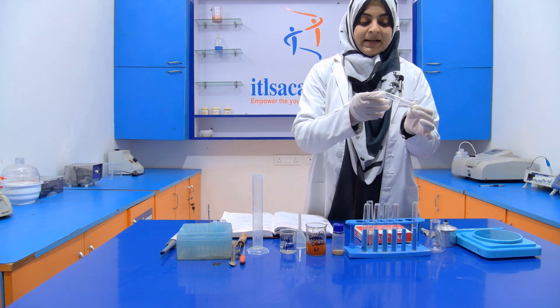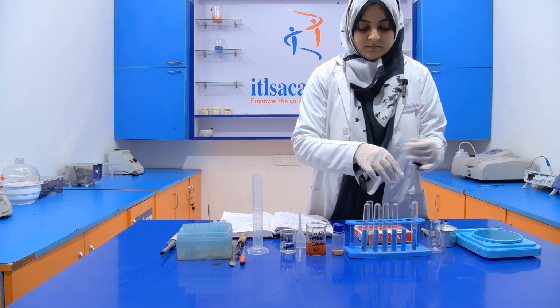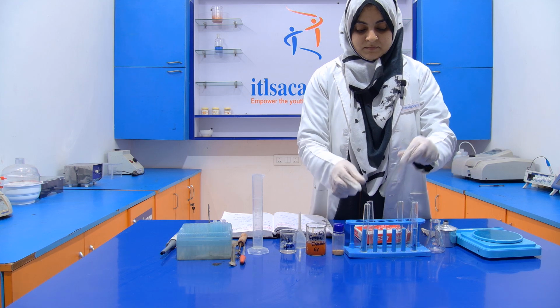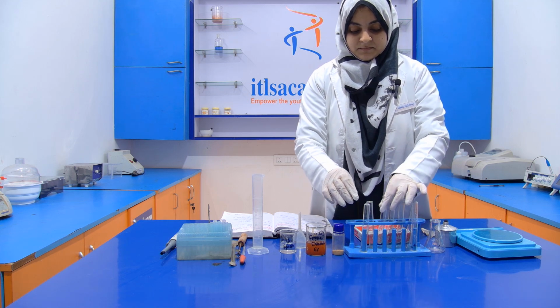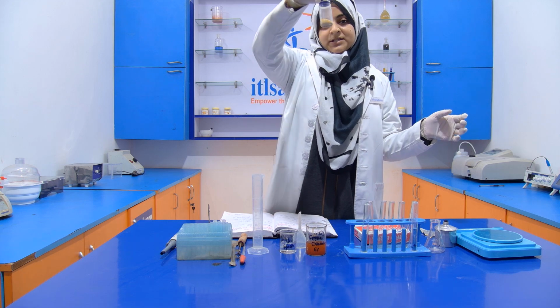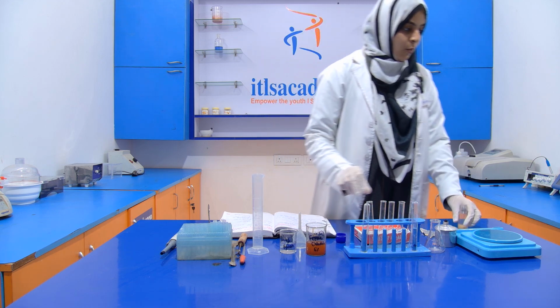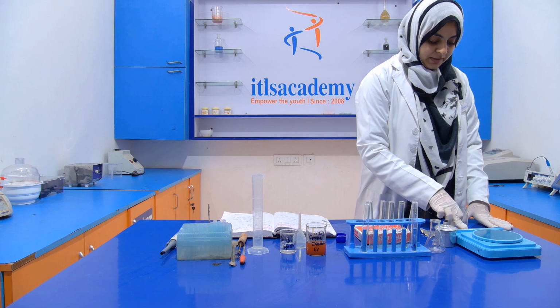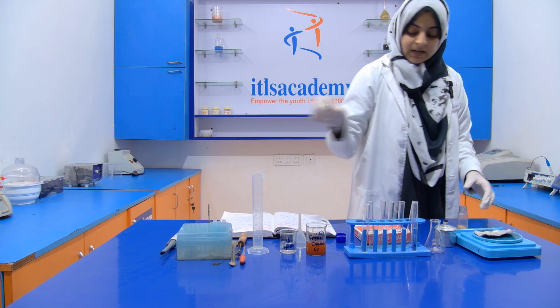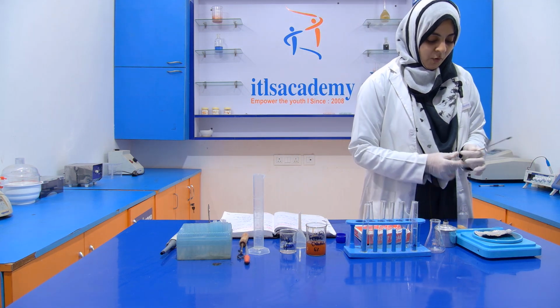Now take a test tube. Obviously this is our sample, the Asafoetida. Now we have to take 1 gram of Asafoetida. Don't forget to tare the weight of that aluminum foil.